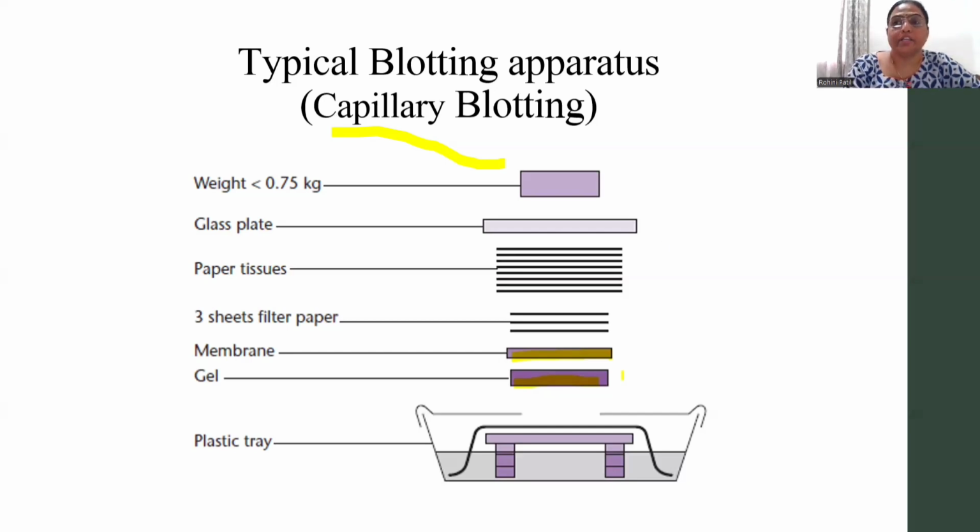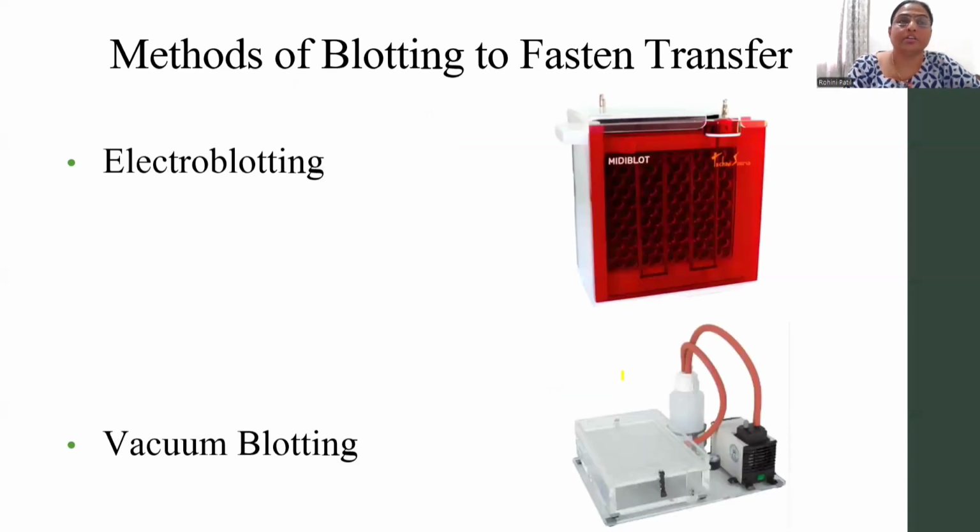This requires around overnight, that is around 16 to 18 hours, for the capillary blotting procedure. To fasten the procedure, there are two methods. One is electroblotting, and the second one is vacuum blotting.